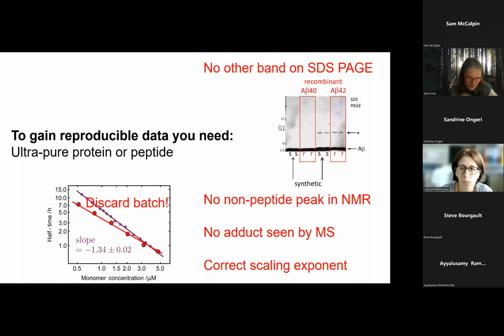Or you can plot it, of course, non-log, but it's still the same. You fit the power function. So if a batch appears like this, we discard it. So we always do this check before the batches go into the freezer and can be used in any kind of experiment. So in this case, you can, of course, continue to purify, because often just one more round of purification may turn it into a pure batch.